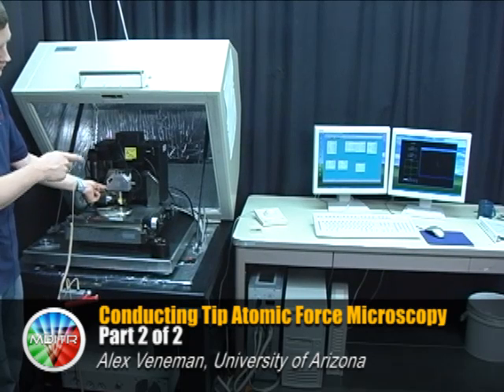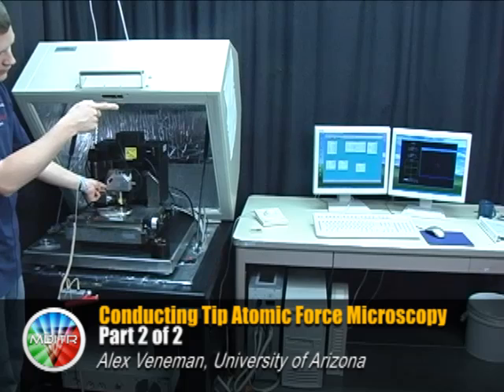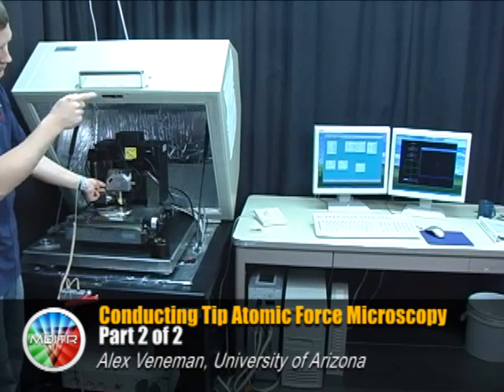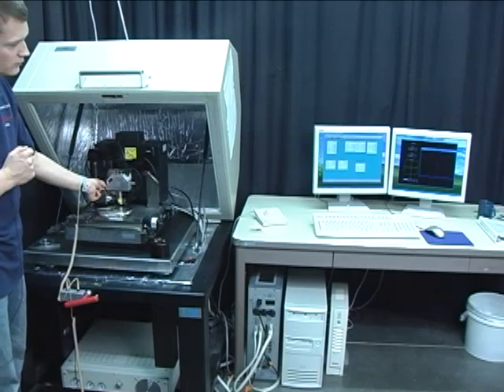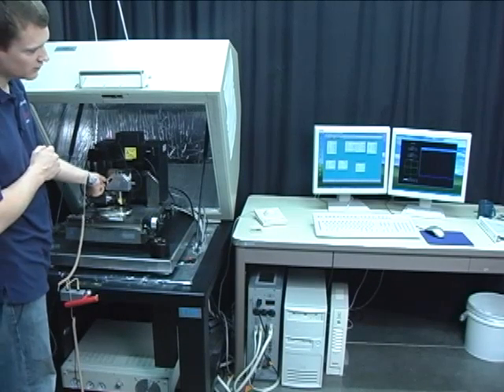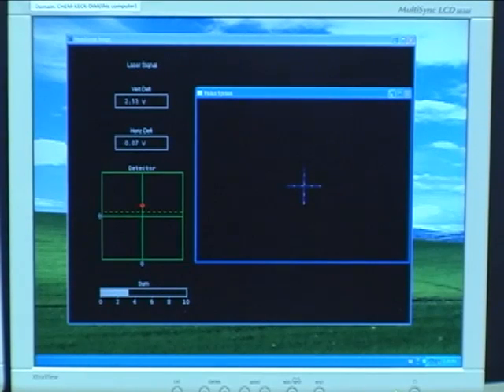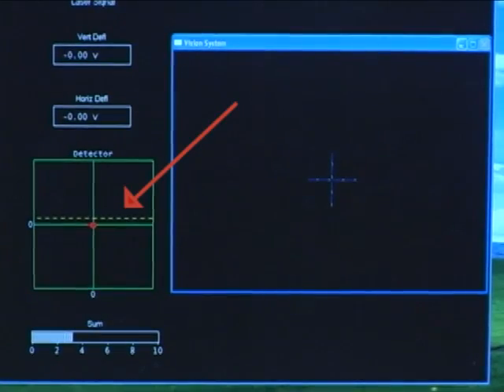Moving the detector around, we can see a dot moving on our screen across the position-sensitive photodiode. We'll zero out the detector by adjusting the knobs so that the simulated laser beam is right in the center of our position-sensitive photodetector.